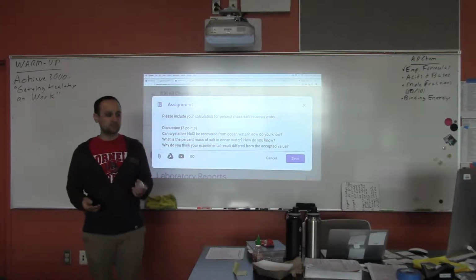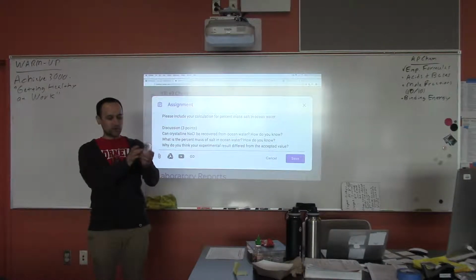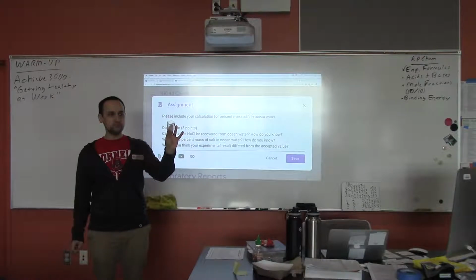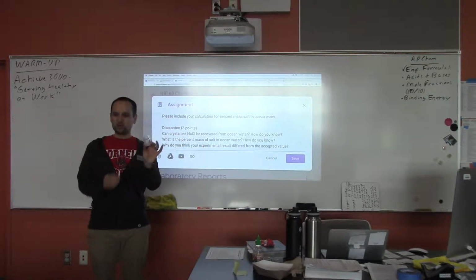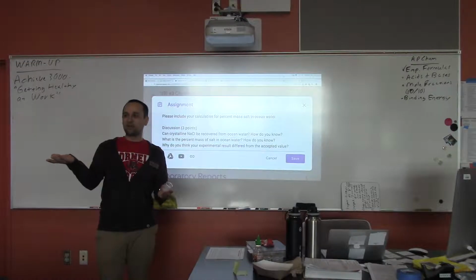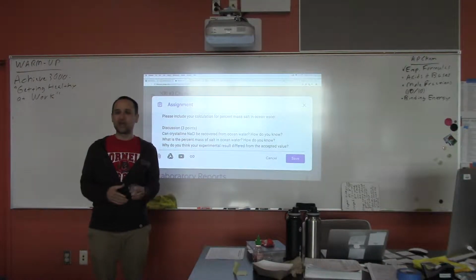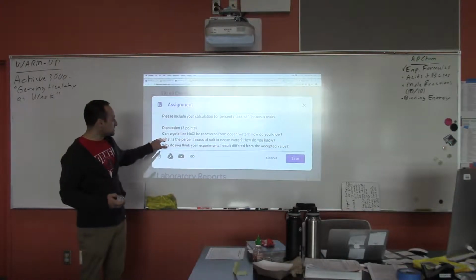And your own number says, well, given the fact that a bunch of this salt, what did it do? We were boiling this thing, and what happened to some of the salt? Did it all stay in the beaker? No, what happened? It sort of popped, right? You didn't get to see this unfortunately, but it sort of popped and exploded, and it wound up on the countertop. So there was all this salt that Ms. Sandoval and I were cleaning off the countertop and off the hot plates. So some of the salt left, right?